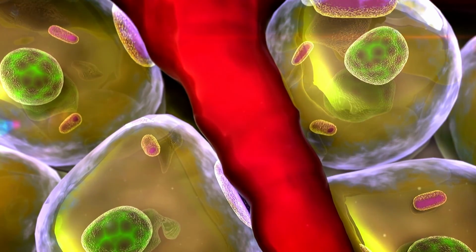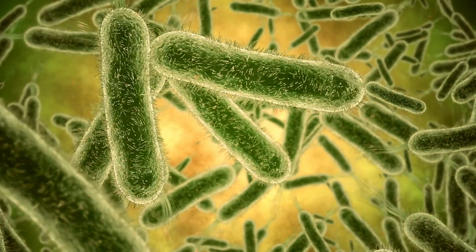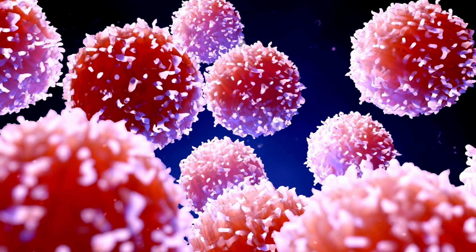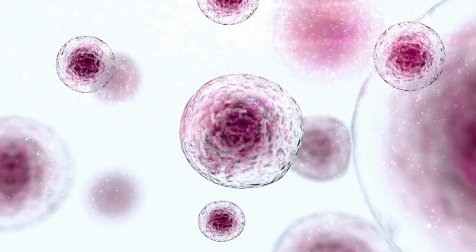Now that we know this, think about the limitless applications flow cytometry can be useful for. We can characterize beads, bacteria, and all kinds of eukaryotic cells you can imagine. We hope this information helped you if someday you have to work with and analyze flow cytometry data. See you!